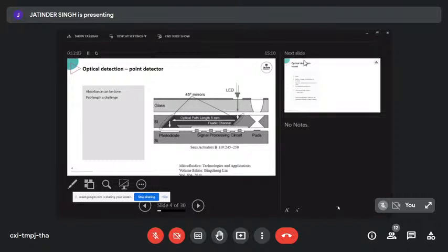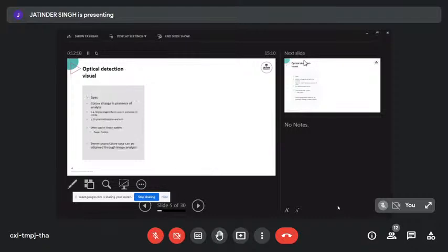But yeah, absorption detection is great if you've got really bright colors. Path length may be a little bit in your way if you want to do absorption detection in a chip. Then we've had the visual detection, where we've got the color change in the presence of an analyte. I see my pictures dropped out here. We'll have lots of colorimetric detection coming on later.